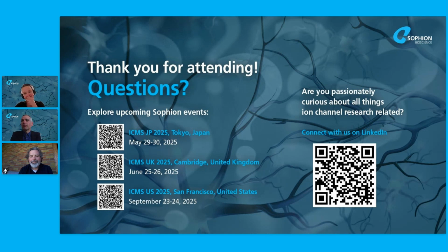Regarding the automated patch clamp, has any characterization been performed to compare the function of cultured neurons attached to a cover slip with dissociated neurons on the automated patch clamp? That is a good question. I think we actually did this comparison, but it's quite some years ago, and I think it was published. I think if you reach out to us, I can find that paper.